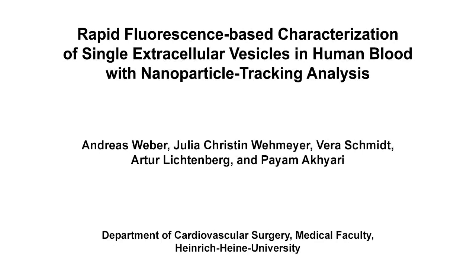This method addresses a common problem within the field and provides a complete workflow for rapid isolation and characterization of single extracellular vesicles with specific markers of interest.